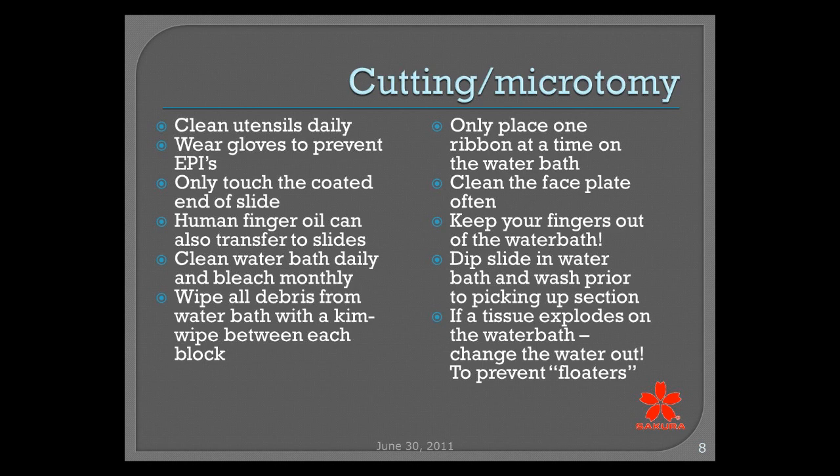I also run across the question, well, I don't understand how I'm getting epithelials all over my slides when I'm wearing gloves as I'm cutting. A couple of things there. One, if you're wearing gloves and let's say you wipe your face or you scratch your head, you have just put epithelials on the outside of your gloves. So you've got to be somewhat diligent about what it is that you're touching when you're wearing gloves when you're cutting. And the other thing is that there's all kinds of stuff floating in the air.